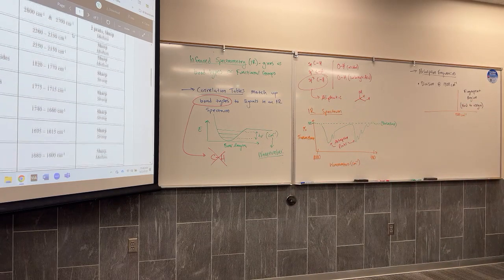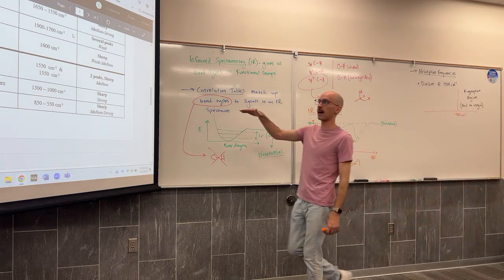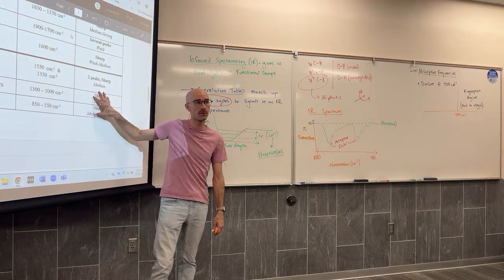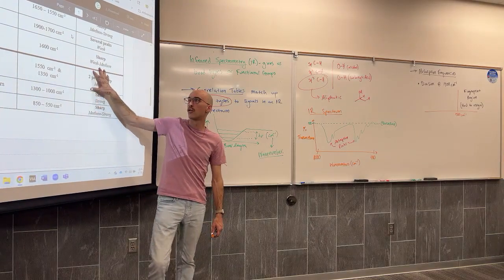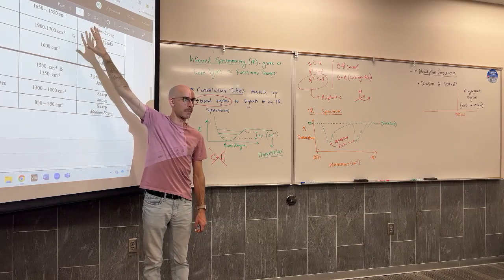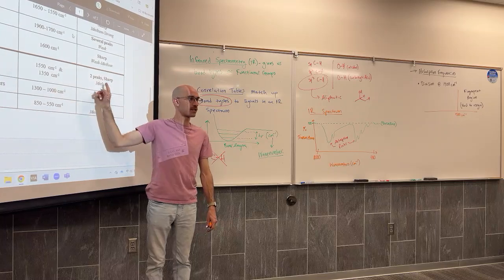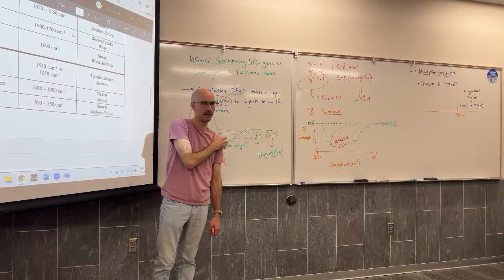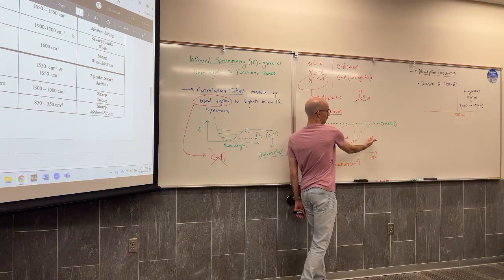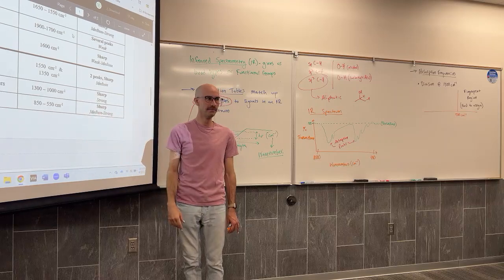If you look at my correlation table, you'll notice this sharp black line that helps to distinguish groups that only absorb in the fingerprint region from groups that do not absorb in the fingerprint region only. It's really easy to take these three columns beneath my black line and say, if I have absorption beneath 1500, it's going to be this, or that.